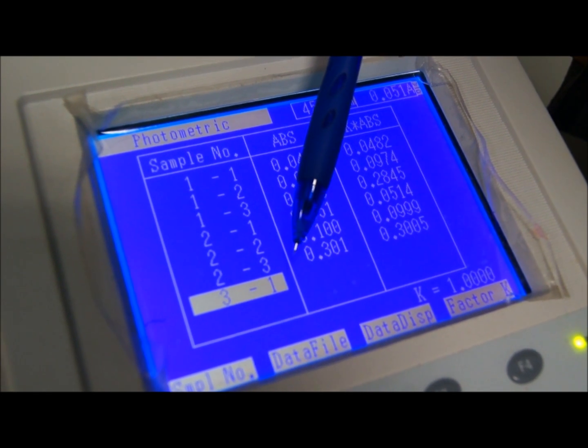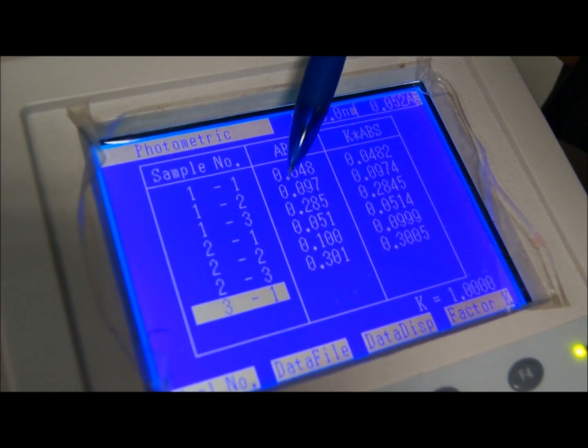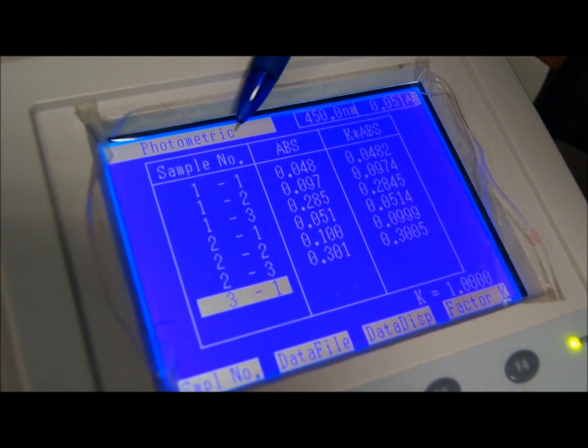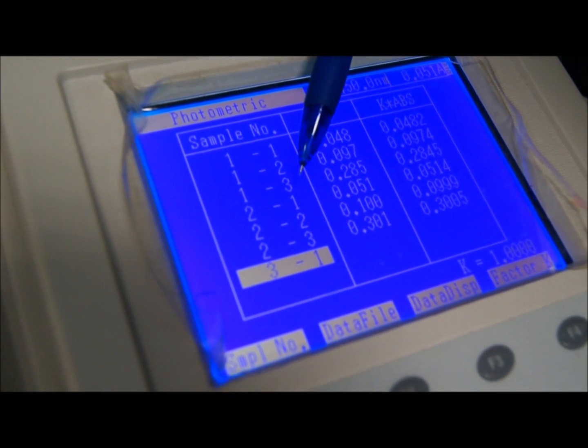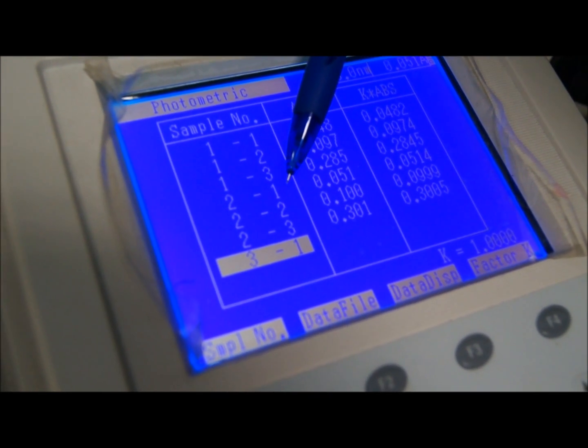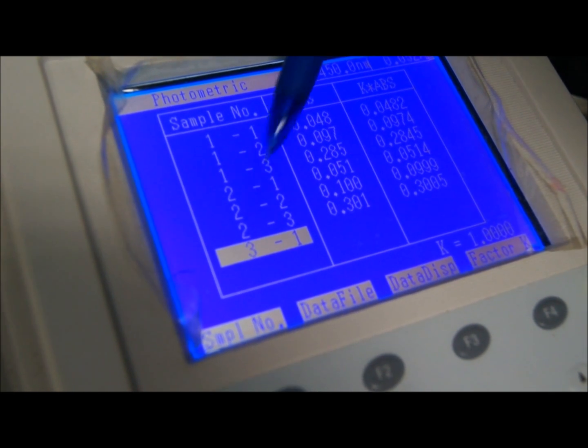Sometimes when you do this after another group has tried it out, you will see something like this. Now what this means is that the first group had these 3 results. These are not yours, but the ones that are the latest set would be in this case sample 2.